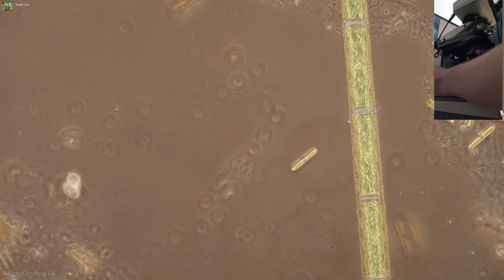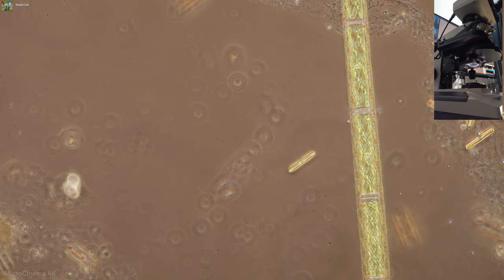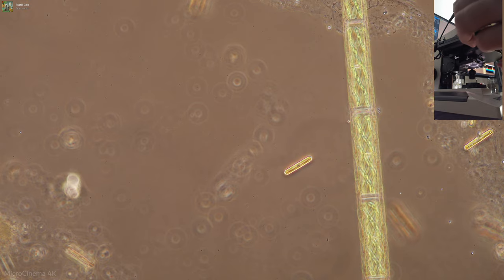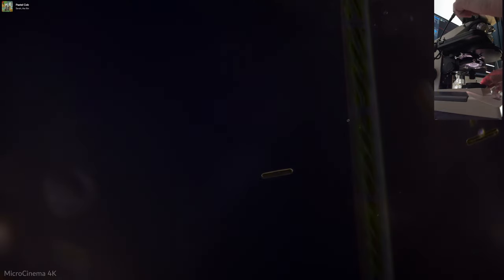But so yeah, let's just try to challenge myself now. I'm going to try to go back to Darkfield. So I'm kind of still new to this, so I'm going to pull in my Darkfield annulus.